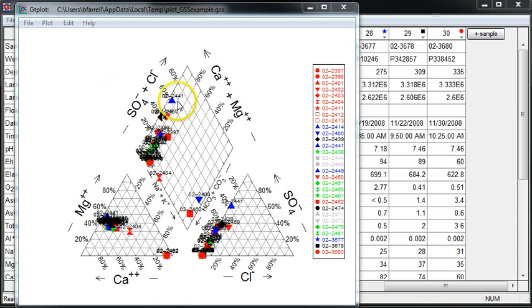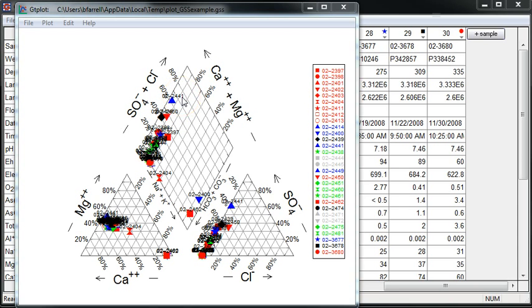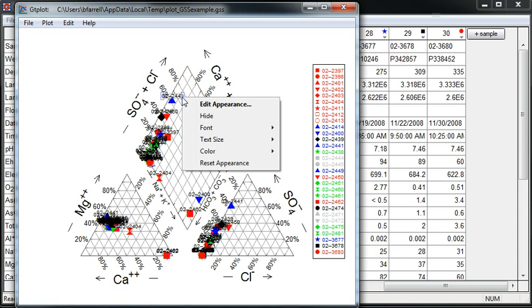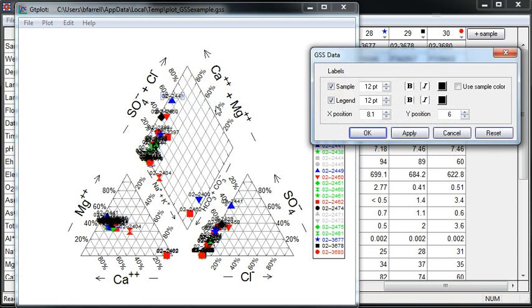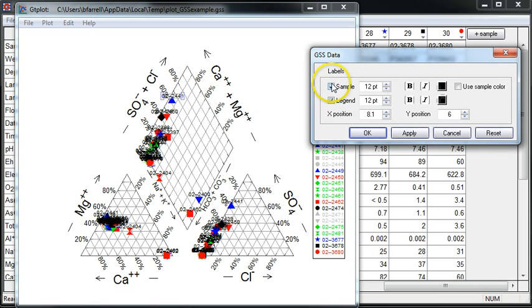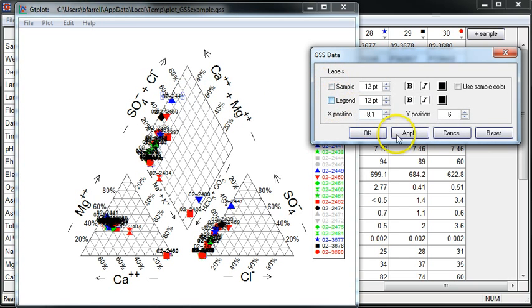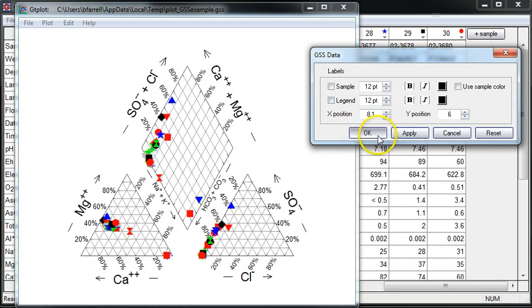I can clean up my plot a little bit. I'll right-click on these sample labels and click Edit Appearance. I'll get rid of the sample labels and the legends, and click Apply.